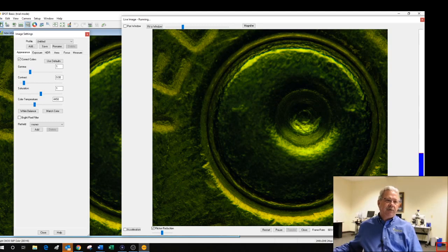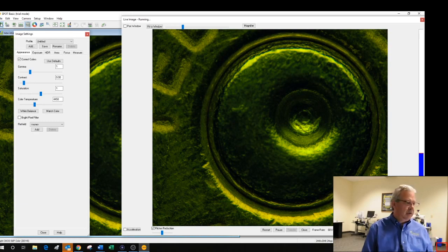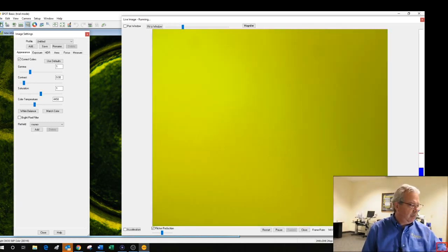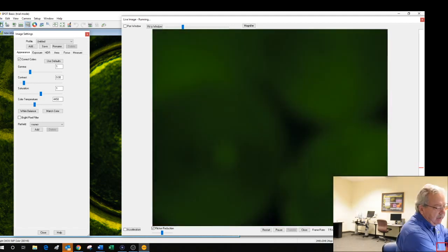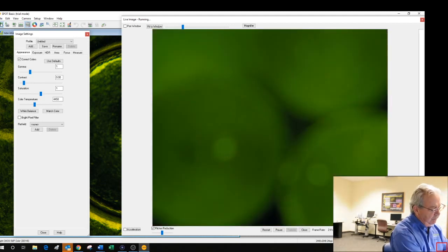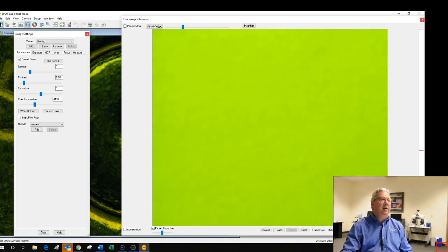And the first and most important thing is the colors are all wrong. Unless we got special Christmas time brass, we're not going to see it. So you can't see what I'm doing at the moment, but I'm putting a big wax platen on, and I'm dropping a piece of white paper in front of that camera. And I'm going to click on what looks like a little colored donut. It is to the right of the image settings controls that we brought up.